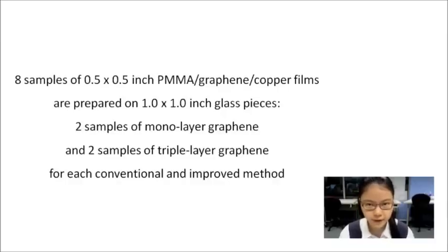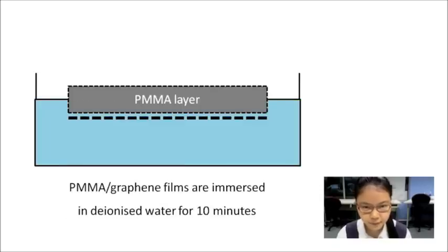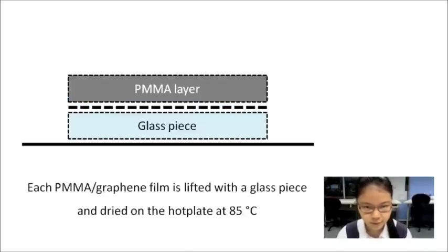8 samples of half by half inch PMMA graphene copper films are prepared on 1 by 1 inch glass pieces, 2 samples of monolayer graphene and 2 samples of triple-layer graphene for each method. The PMMA graphene copper films are prepared by CVD and the glass substrates are cleaned by sonication. The PMMA graphene copper films are immersed in ferric chloride solution for 40 minutes to etch away the copper layer. The remaining PMMA graphene films are immersed in deionized water for 10 minutes to remove the ferric chloride solution. This process is repeated 5 times before each PMMA graphene film is lifted with a glass piece and dried on a hot plate at 85 degrees Celsius.